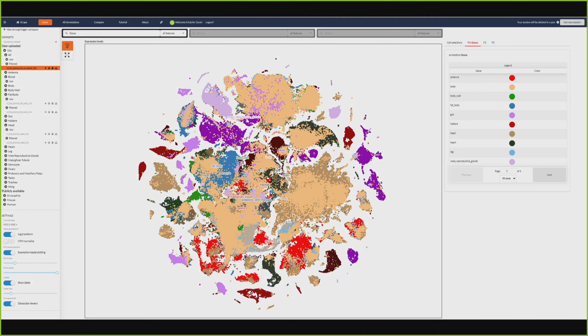So with the clusters, you can search for this by name. So for example, indirect flight muscle, I'm going to show and use this as an example throughout. You can also search by a cluster number, however it's been named in the file. This highlights in red as a solid color. It's either true or false that it's in this cluster. But on the right here, this is how you'll see the annotations that were made during the Jamborees. You can see it was made by the FCA BioHub and with 6 endorsements from different people.